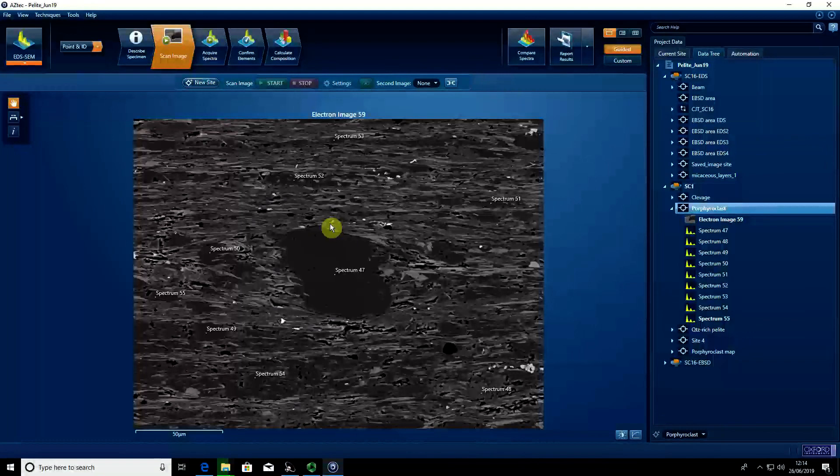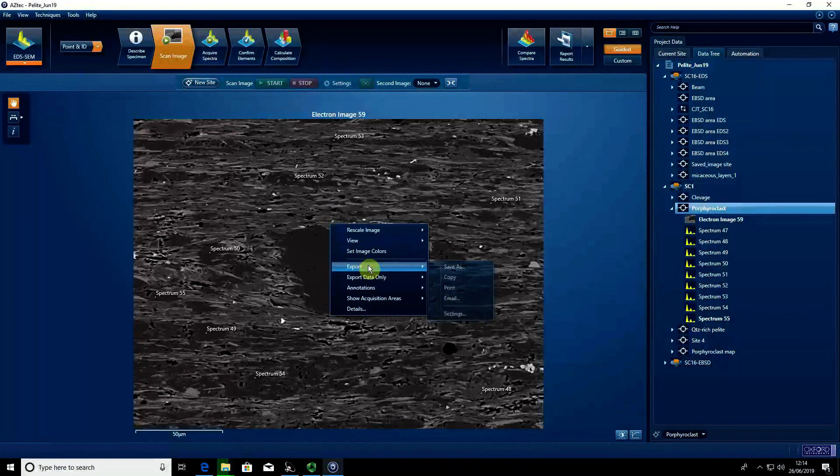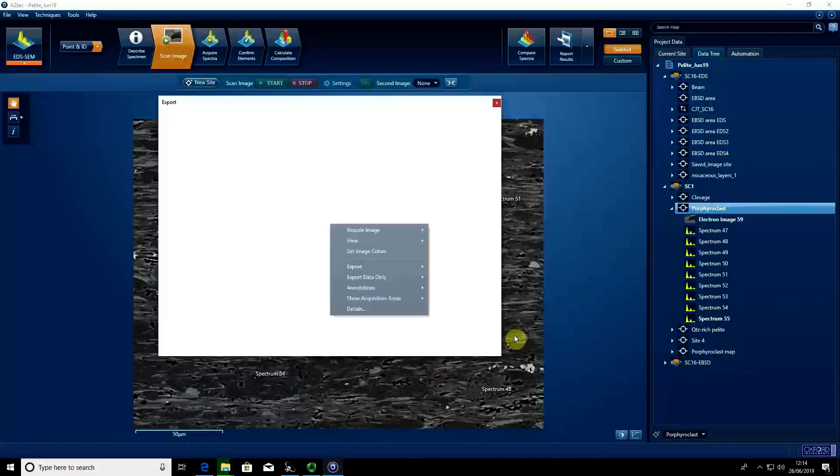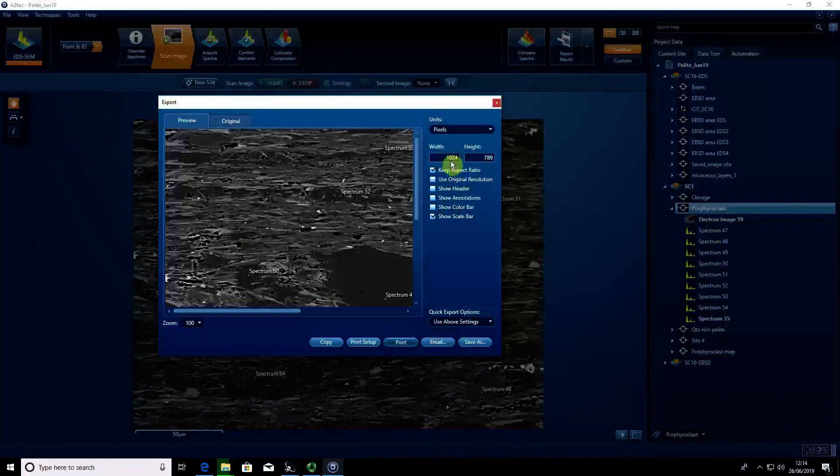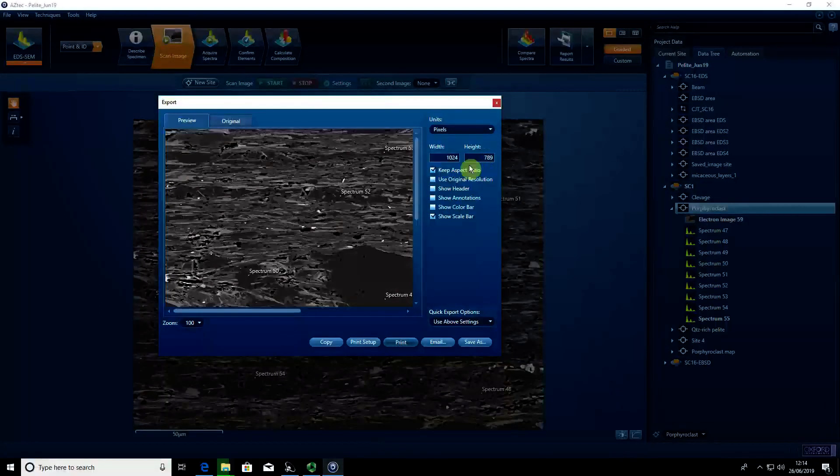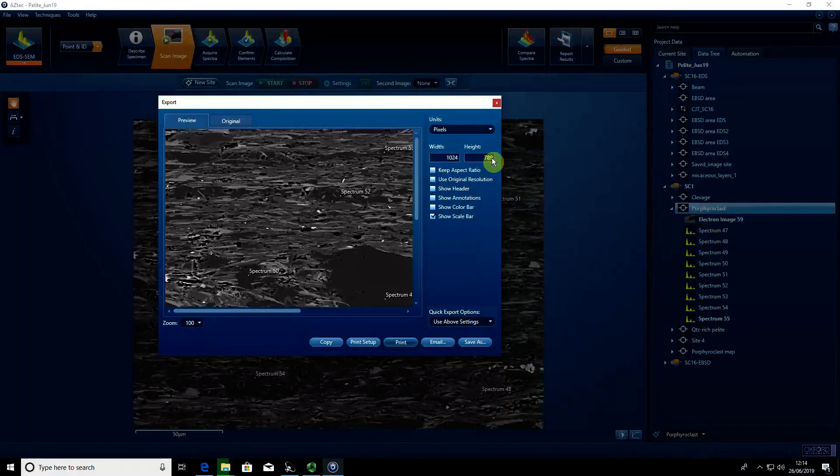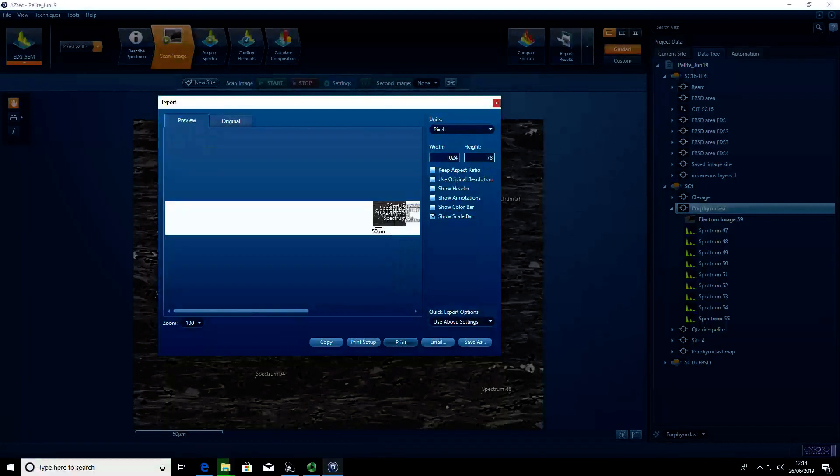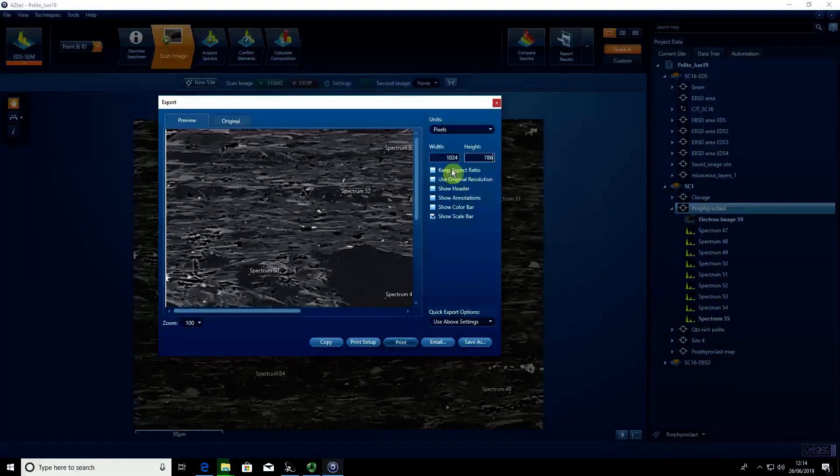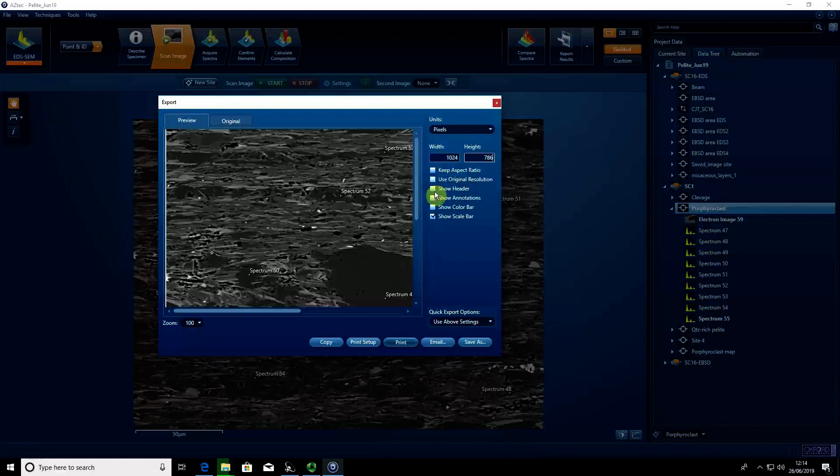I right-click again on the image, go to export, and then to settings. You can see I've got 1024 by 768, which is the actual resolution. I'm going to turn off 'keep aspect ratio.' I'm keeping everything else turned off apart from showing the scale bar.